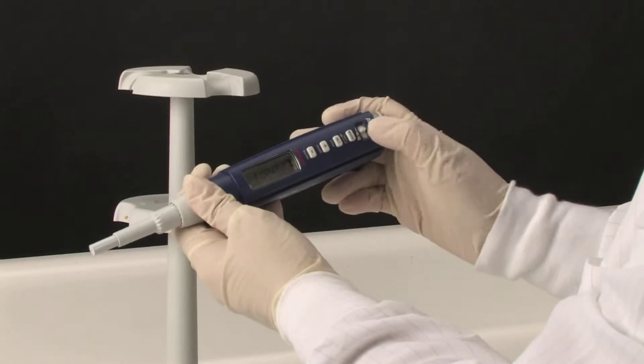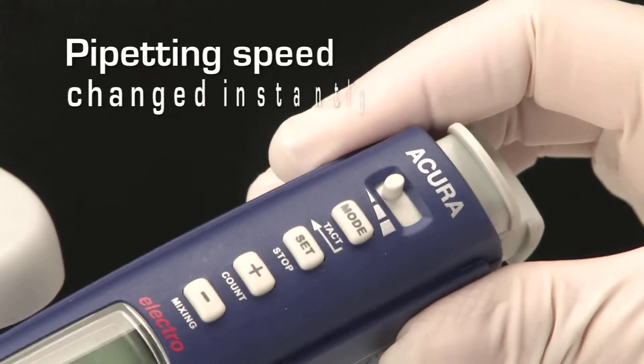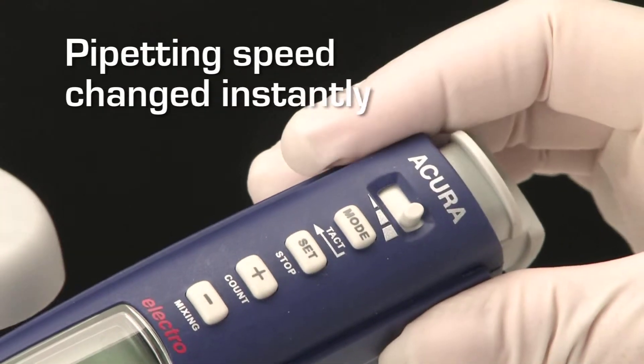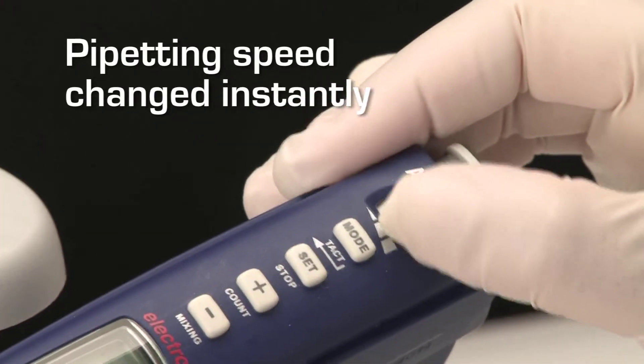Three pipetting speeds can be selected quickly and easily. To change the speed before or during operation, simply move the selector to the right to increase the speed, or to the left to decrease it.